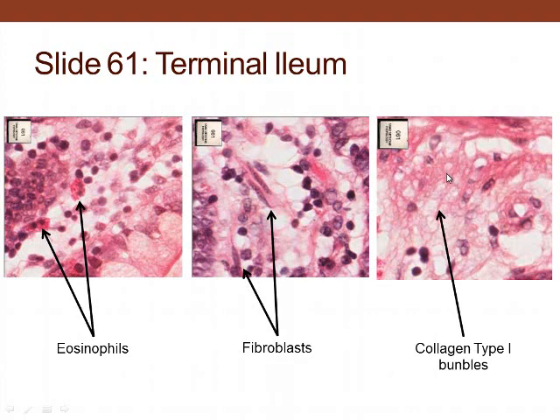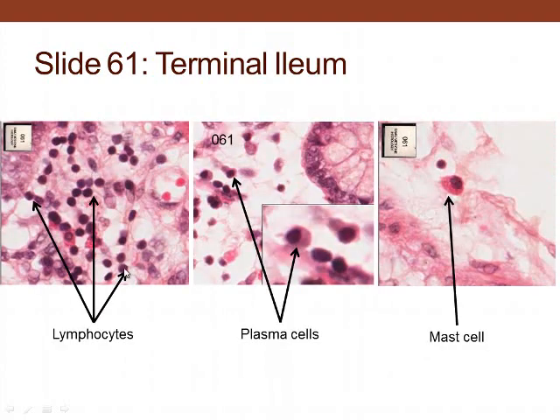Here we see large collagen bundles in the extracellular matrix. We also see lymphocytes — small cells with a mostly spherical nucleus. Plasma cells have more cytoplasm associated with them, and the chromatin in the nucleus takes on a clock-face or cartwheel-spoke appearance. Mast cells, unlike eosinophils, have a large, non-lobulated nucleus.